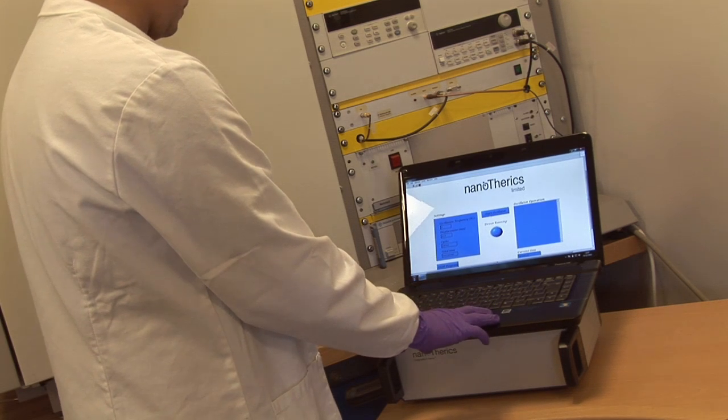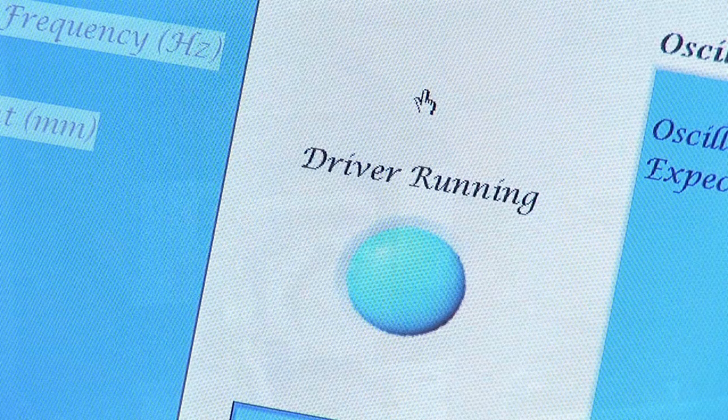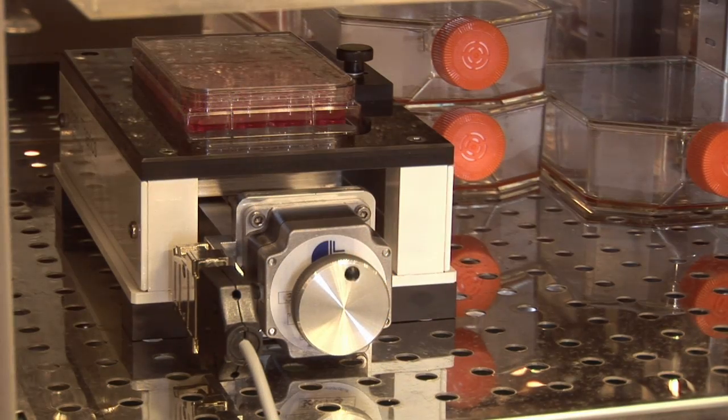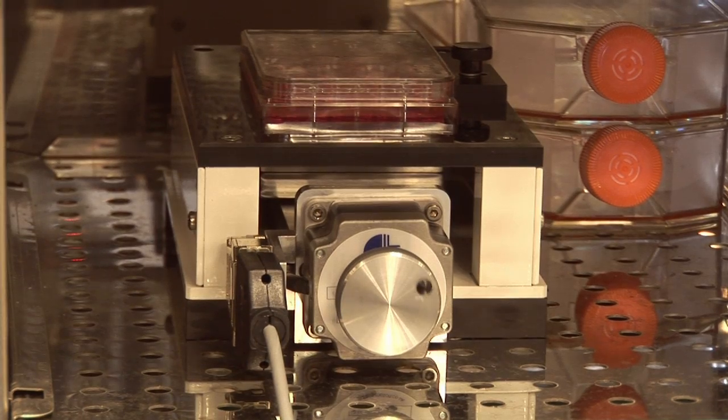Launch the Magnafect Nano system by clicking Start Oscillator on the Nanofect software. It is the oscillating magnetic field that increases the uptake of DNA complexes, enhancing transfection.